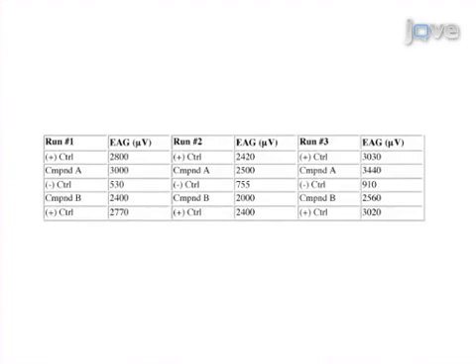Ultimately, results can provide a truncated series of components or blend of components ready for further investigation in behavioral studies with the insect of interest. The main advantage of this technique over existing methods, such as time-intensive behavioral studies, is that rapid screening by electroantennographic analysis significantly decreases the number of compounds needed to be taken on for other studies.